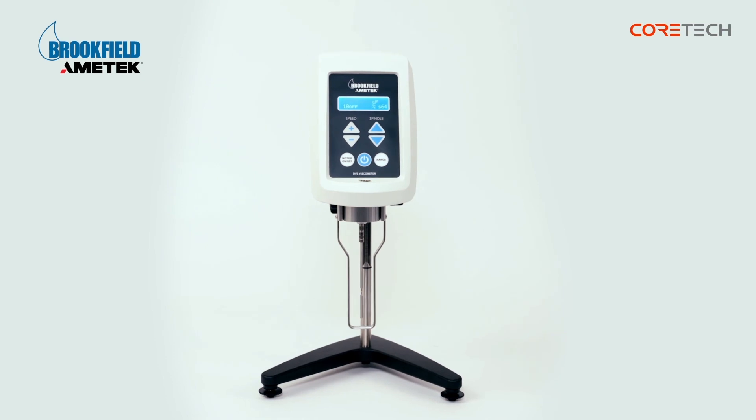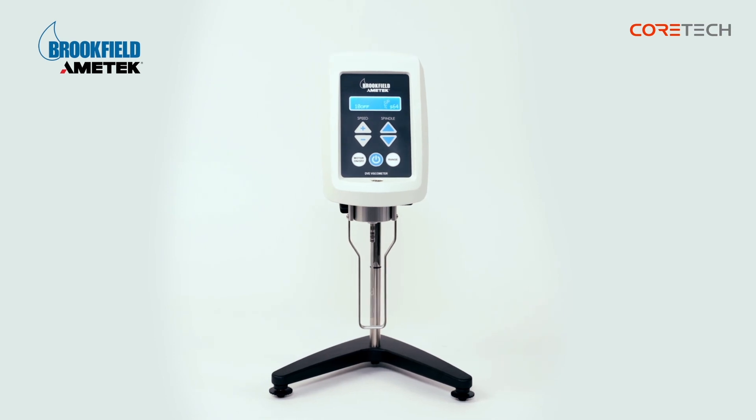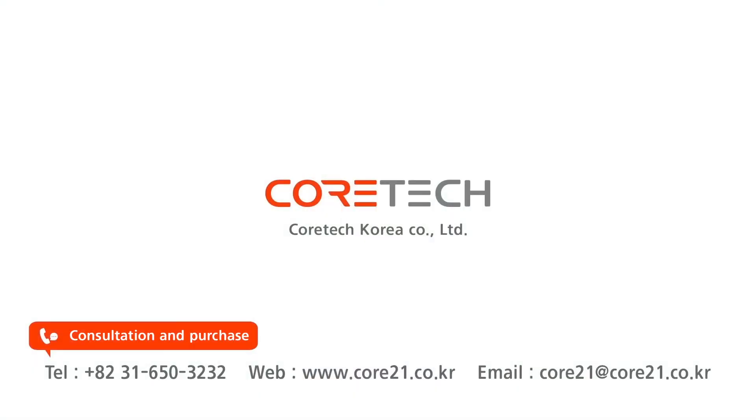That was a description of Brookfield's Rotary Viscometer DVE. For consultation and purchase inquiries, please contact CoreTech Korea. Thank you.